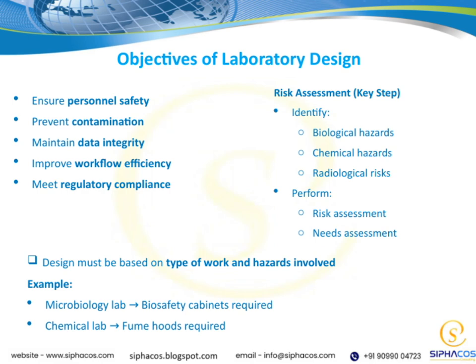This involves identifying potential hazards, such as biological risks, chemical dangers, and radiological risks. Once these hazards are recognized, performing a detailed risk assessment helps determine what measures need to be in place to mitigate those risks. This step also includes a needs assessment to understand what specific resources, equipment, and safety features are required for the lab's particular functions.